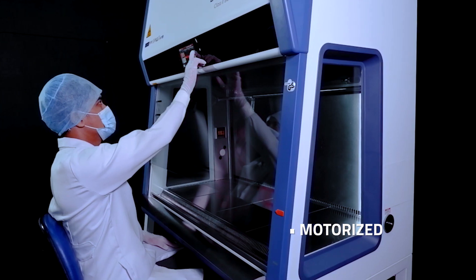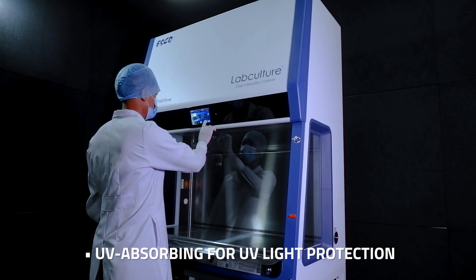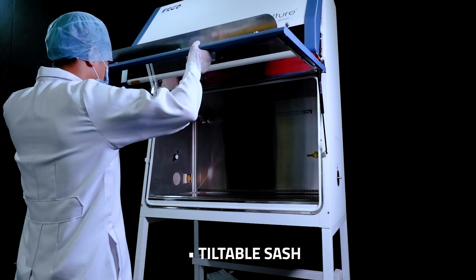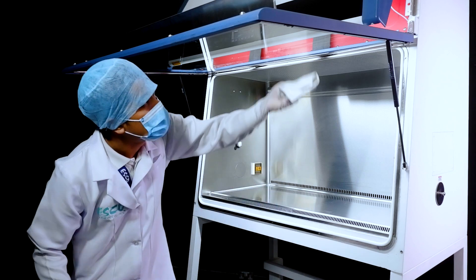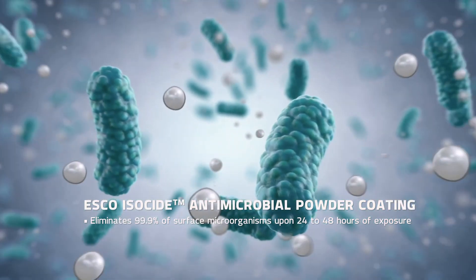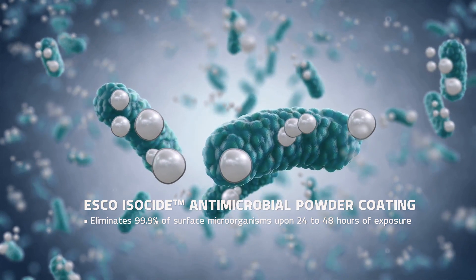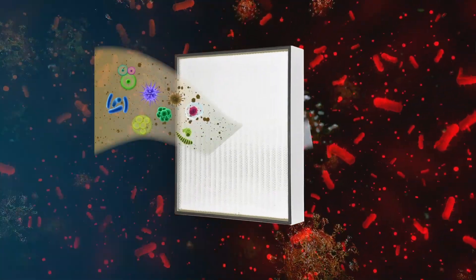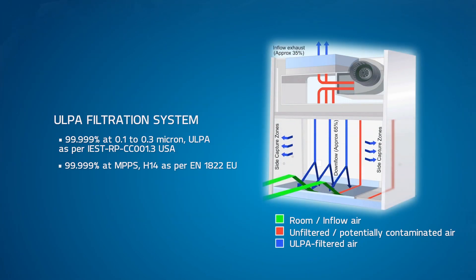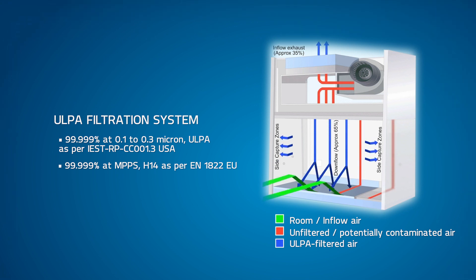Boasting its ergonomic motorized sash, controllable via the Centurion Touchscreen Controller, and the new tiltable sash feature that allows seamless cleaning of the interior sash. ESCO isoside antimicrobial powder coating eradicates 99.9% of surface microorganisms after 24 to 48 hours of exposure. Teamed up with an elite filtration system, achieving 99.999% efficiency in filtering particles ranging from 0.3 to 0.1 microns in size.